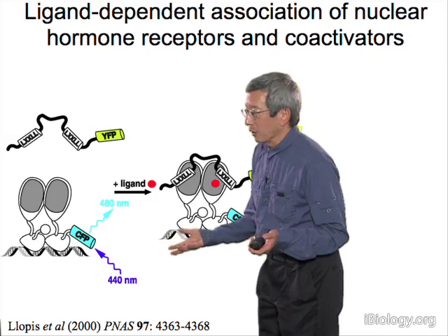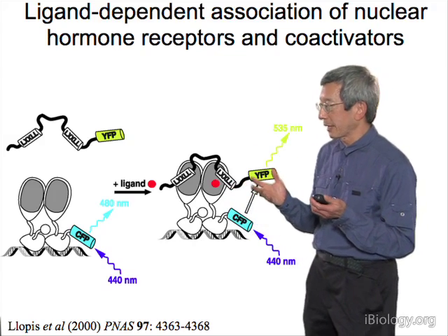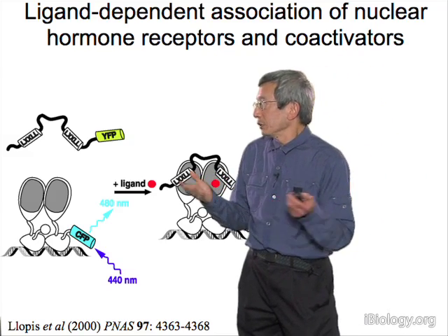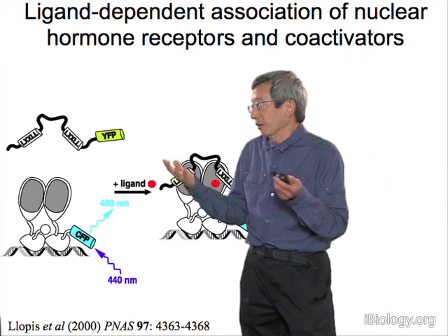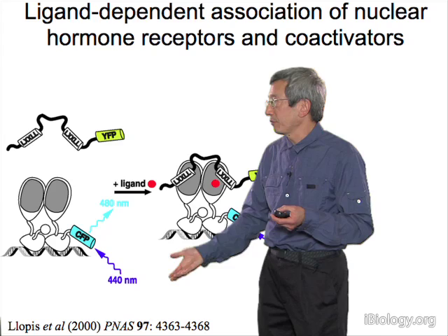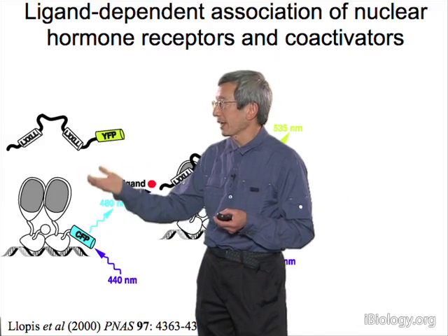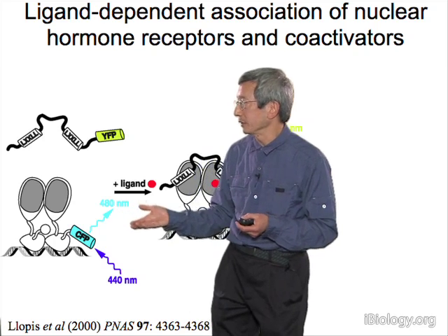Though up to now I've been talking about traditional biochemical signals that are soluble, things like calcium or cyclic AMP, if you just want to watch when a pair of proteins gets together, this form of induced protein-protein interaction is simple. You put CFP on one of the proteins, YFP on the other. There's no guarantee that every such construct will put the cyan and yellow close enough for good FRET, but there's a reasonable chance, and you try things until you find ones that work.